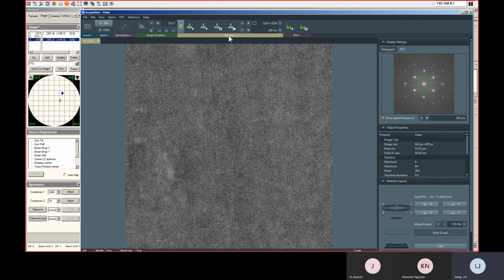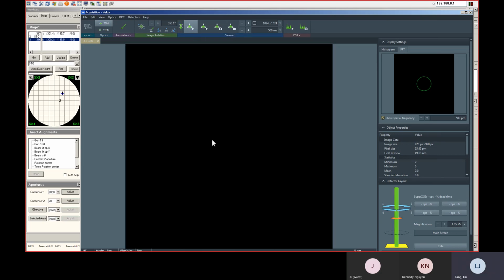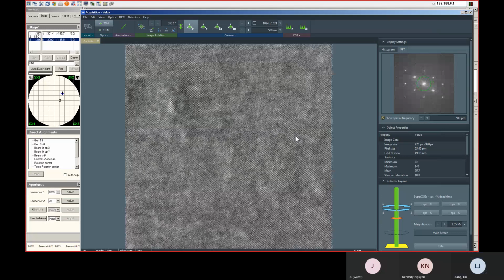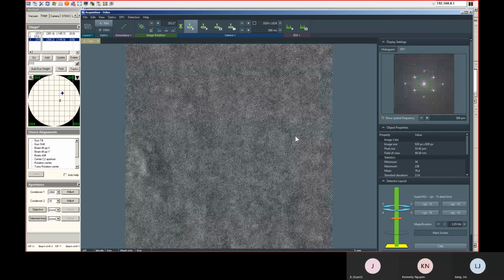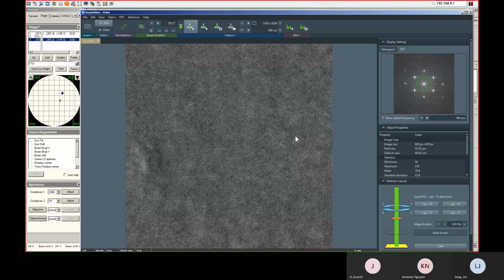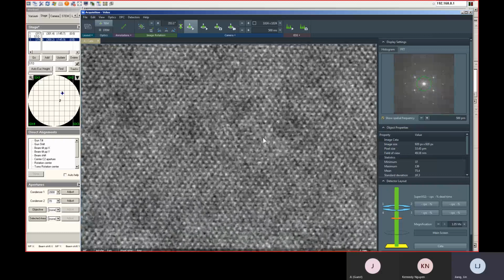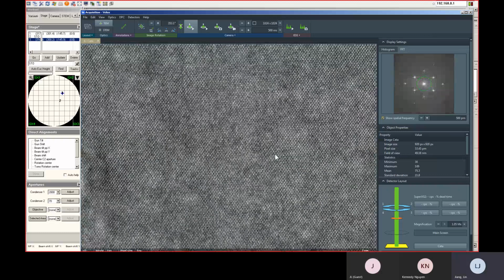And another thing is, because right now we are reading the whole region, right now we get a lot of drifting. You see, we have someone working around. We cause some drifting.